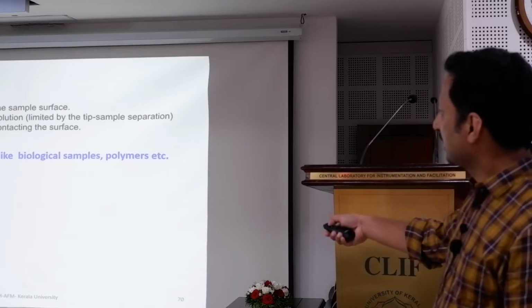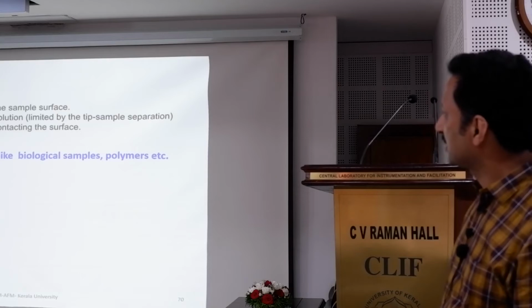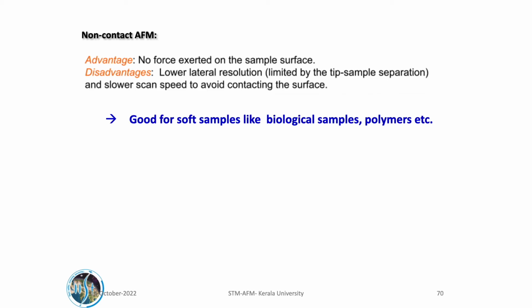Non-contact AFM, generally the advantage is that no force is exerted on the sample. The disadvantage is lower resolution. To overcome that we have the tapping mode. So tapping mode is usually preferred over contact and non-contact AFM.